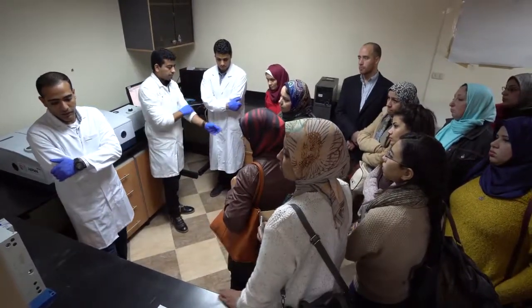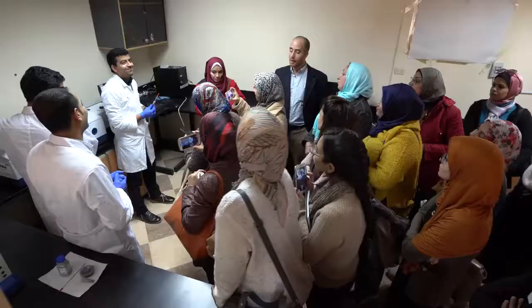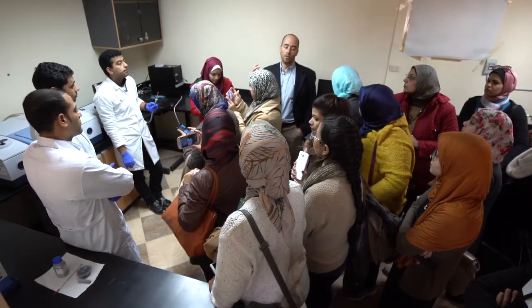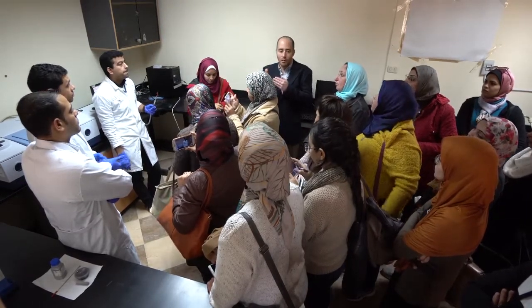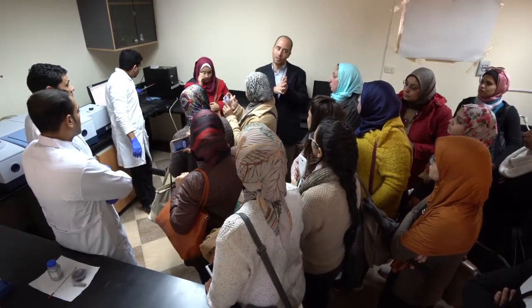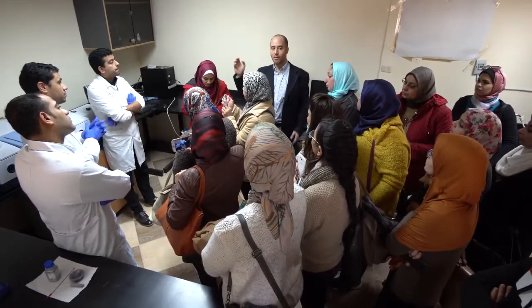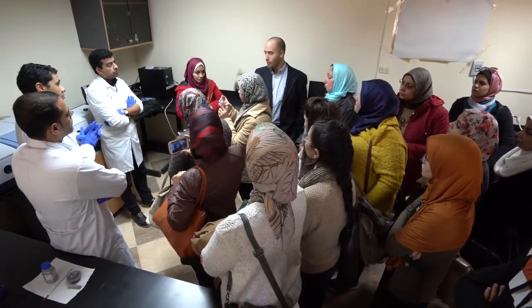Okay, we have a KBr. And to be honest, in our field, the tendency is now towards using this kind of instrumentation, or using the small instrument which you can take to the object. There are reflectance instruments, portable instrumentation. But there are intrinsic limitations behind this, because maybe the kind of results you get are not going to be as clean as the ones you can get in this instrument with KBr. Okay, but I will leave you to explain.